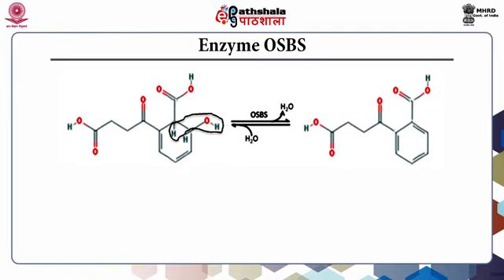OSBS belongs to the enolase superfamily of enzymes characterized by the presence of an enolate intermediate which is generated by abstraction of the alpha proton of the carboxylate substrate. It catalyzes the dehydration reaction of the substrate, that is 2-succinyl 6-hydroxy 2,4-cyclohexadiene 1 carboxylate, to produce product OSB, that is orthosuccinyl benzoate. We will carry forward the same example to analyze its active site.